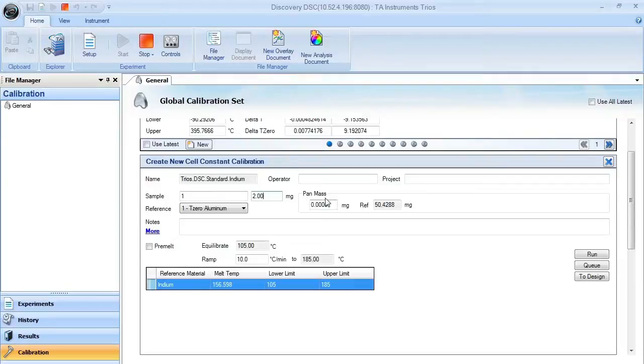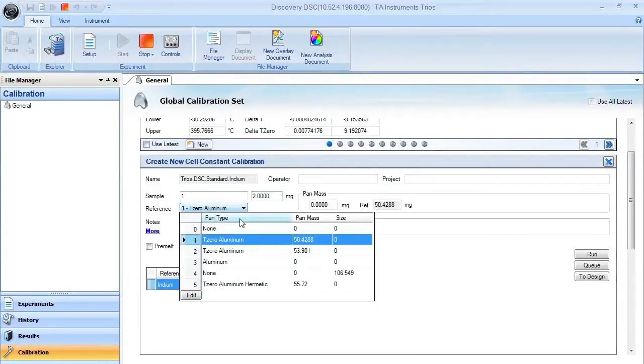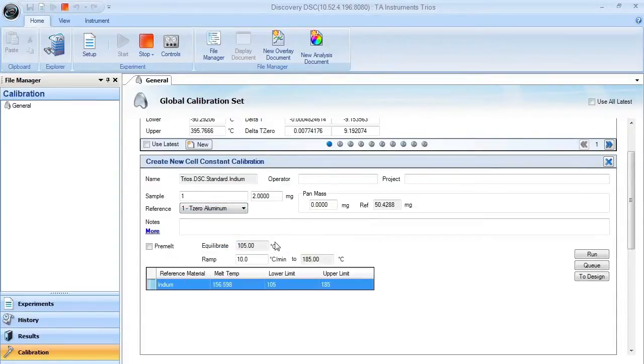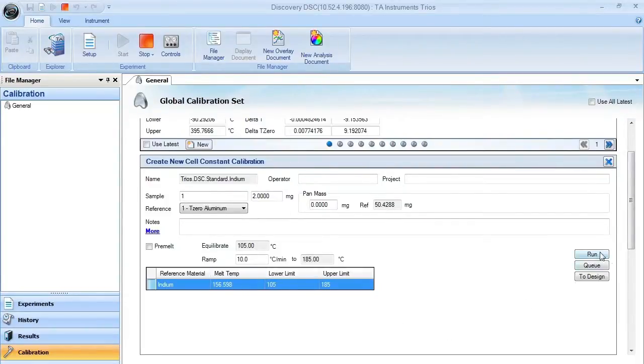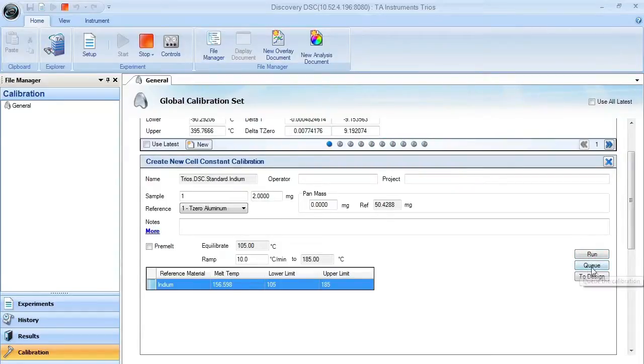Sample pan mass and reference pan mass should be selected through your reference pan type. In this case, we're going to be using T0 aluminum. When you have all the items entered correctly, you can either automatically run it choosing the run button, queue it in the running queue, or push the queue button.